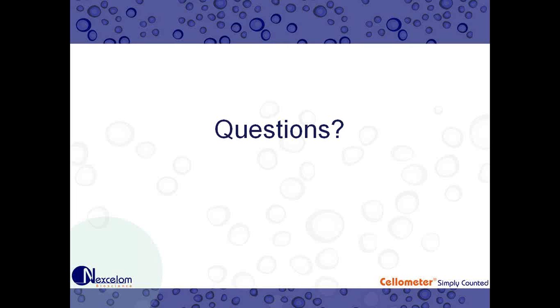Thank you for your question. There are a bunch of formulas depending on what you want to do your assay for.